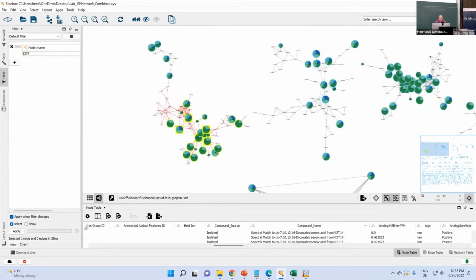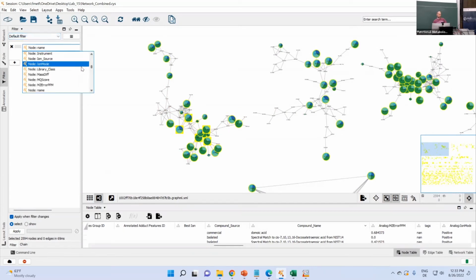Is there a way in Cytoscape to filter the table, let's say, where stats is significant and has a compound name? So it makes it easier to... Yeah. So that's kind of what I did here right now, navigating, right? You can have this filter tab, and then, okay, let's do what you just said. Besides using the filter function right away in the table, I want to set some general filters. So I could use this binary information from the stats table.